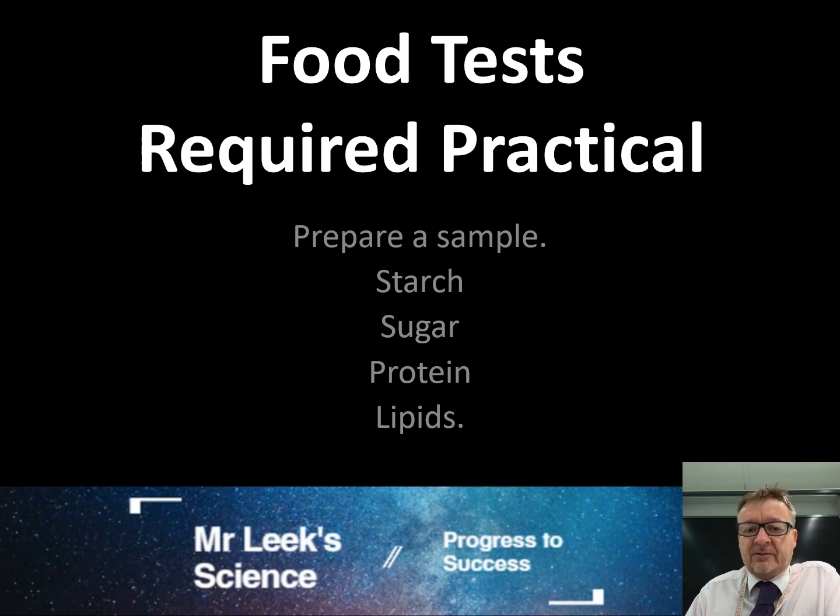This is the food test required practical. What I'm going to do is go through five very simple methods.